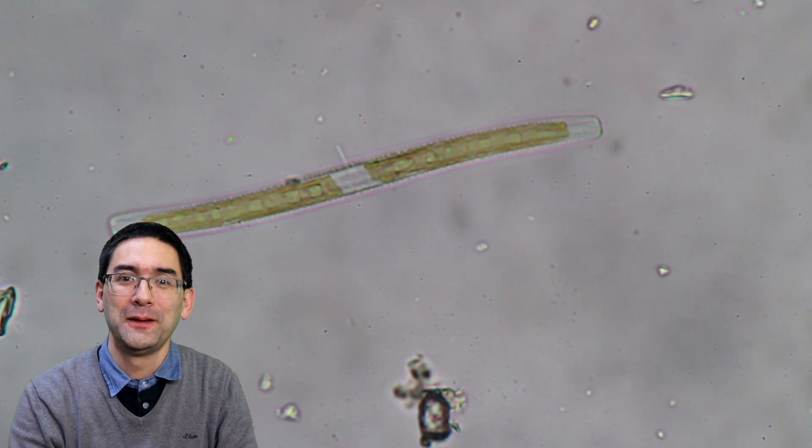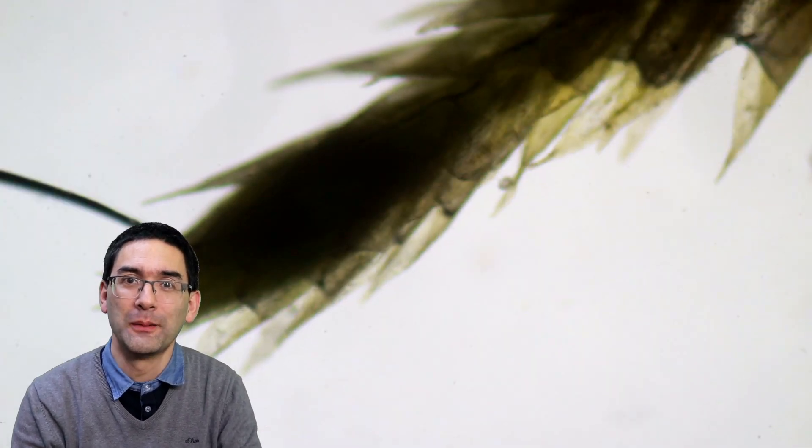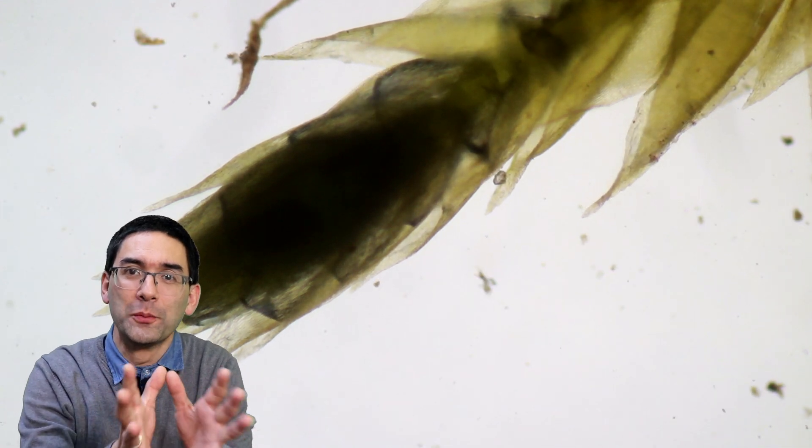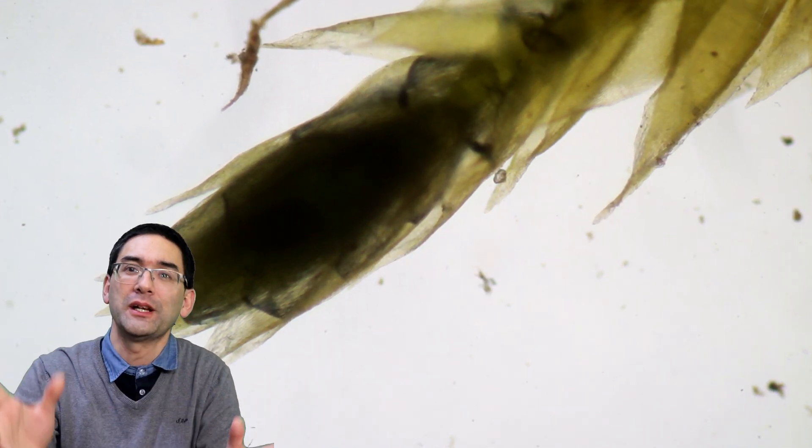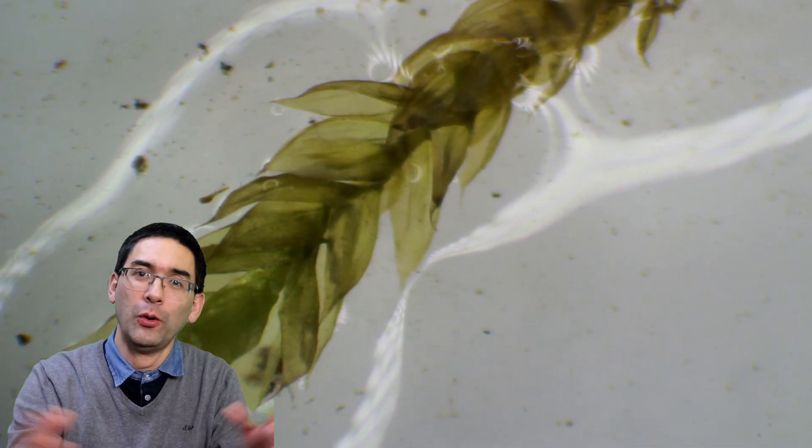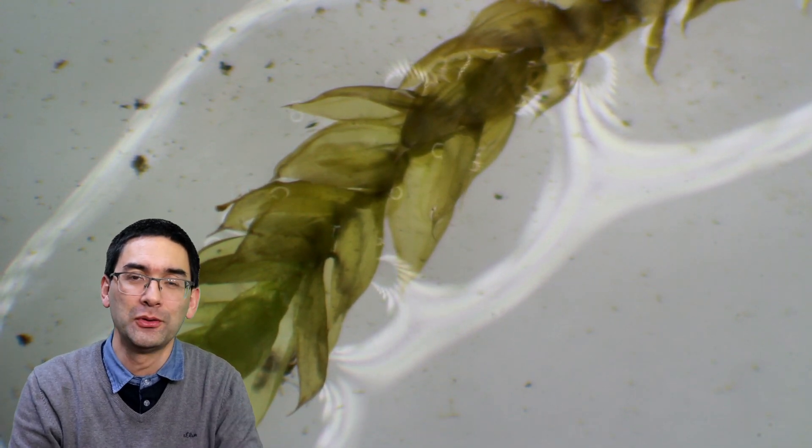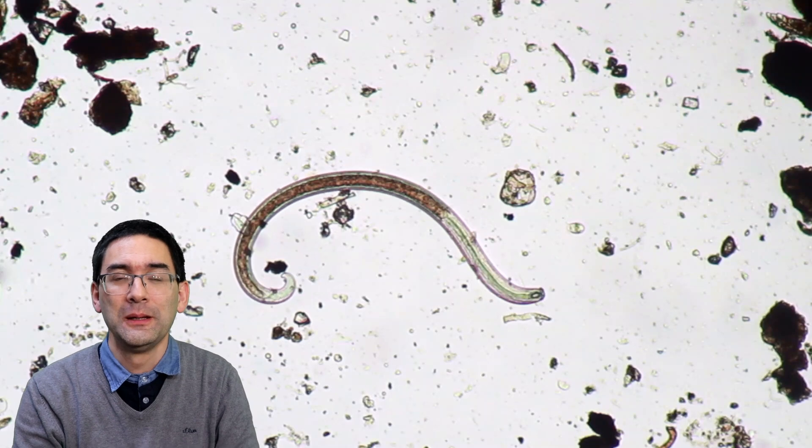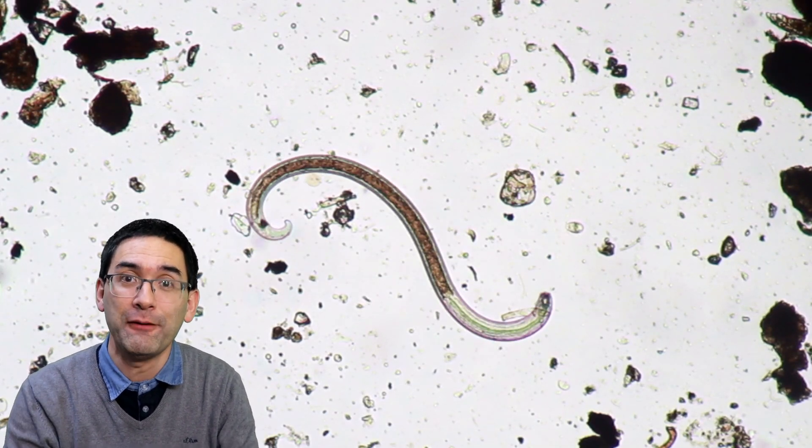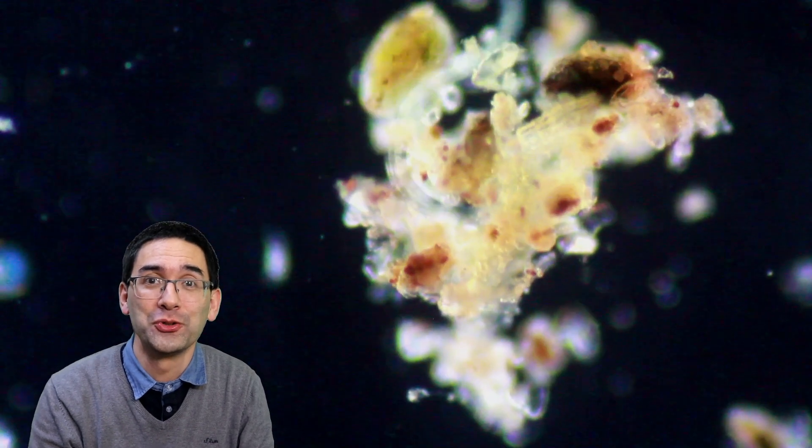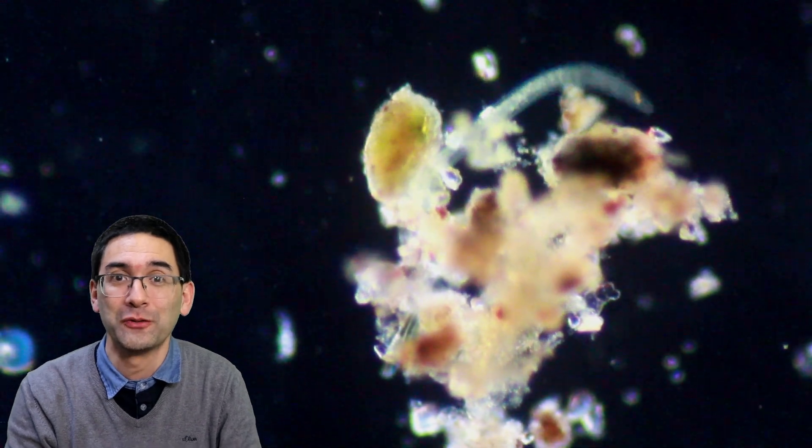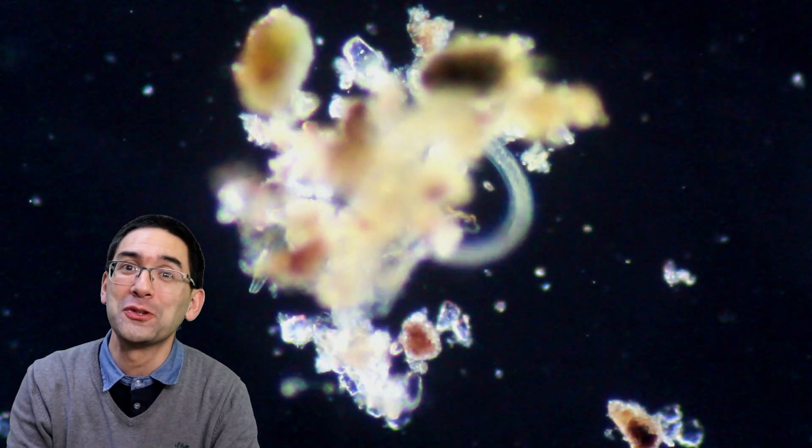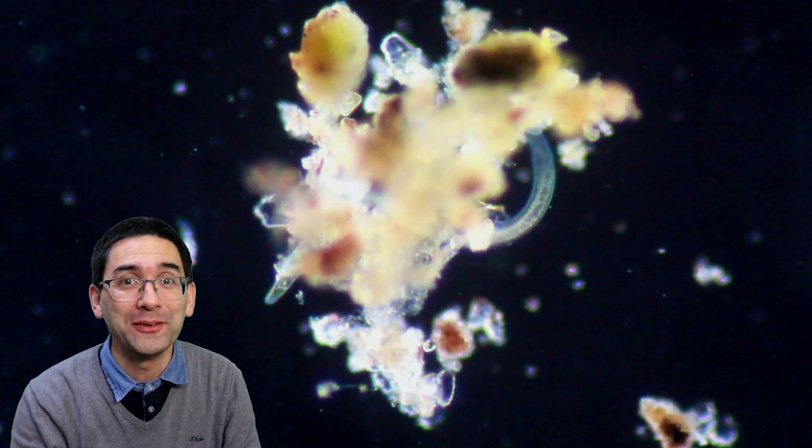Let's have a look at some moss. I added a little bit of water onto the moss, also in time-lapse now, and you can see how the moss absorbs the water and how the leaves start to separate as it absorbs the water. You can see a whole bunch of different things I put under the microscope. During summertime or springtime when it's warmer, I might observe different microorganisms. But in any case, I was quite happy to have found these things. This shows that even in wintertime there are plenty of things you can observe. That should be enough for today. I wish you all the best. Happy microbe hunting as always. Please do consider subscribing to the channel if you liked it. See you around next time. Bye bye.